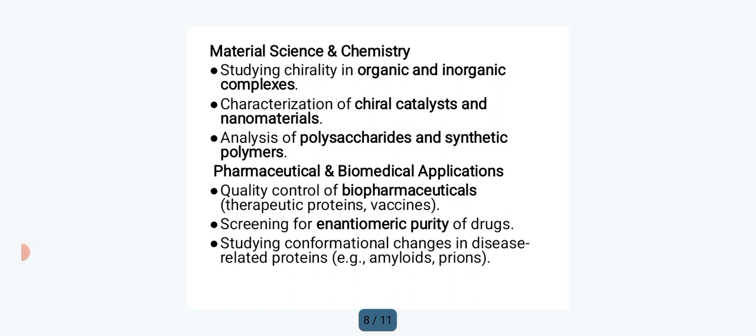And the next use of CD spectroscopy is in pharmaceutical as well as biochemical or biomedical applications. Here, quality control of biopharmaceuticals, that is therapeutic proteins and vaccines. In a vaccine, we can find out how much quality there is, the quality control. For that purpose we can use the spectroscopy.